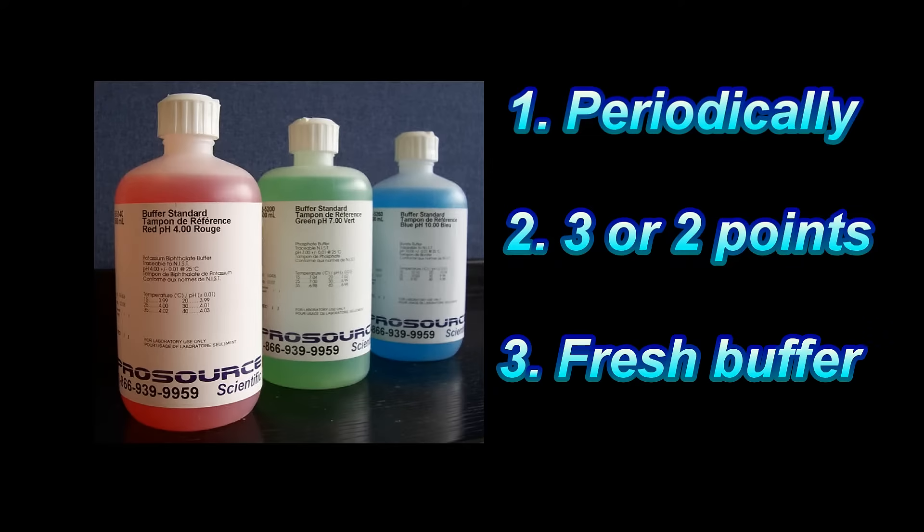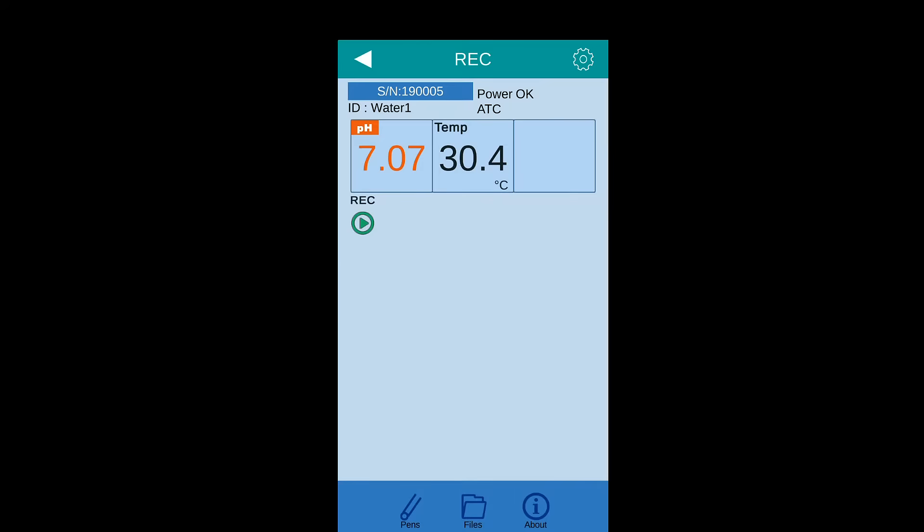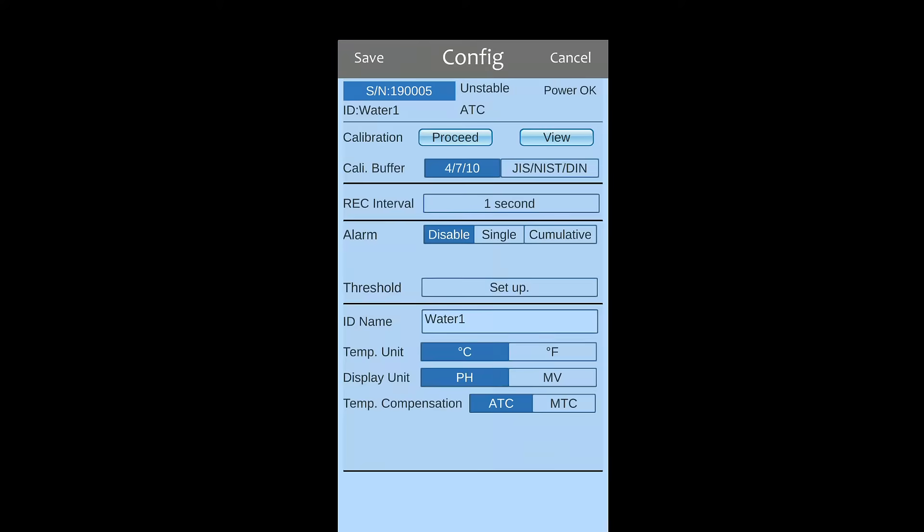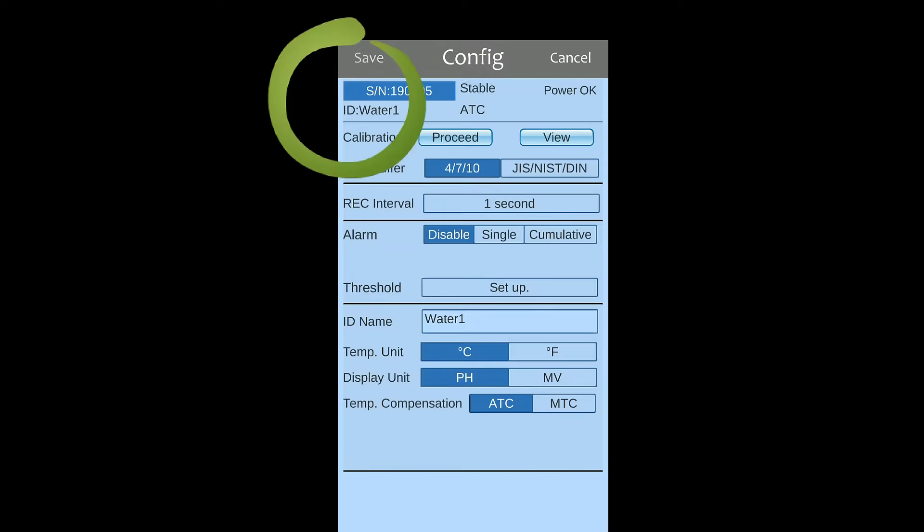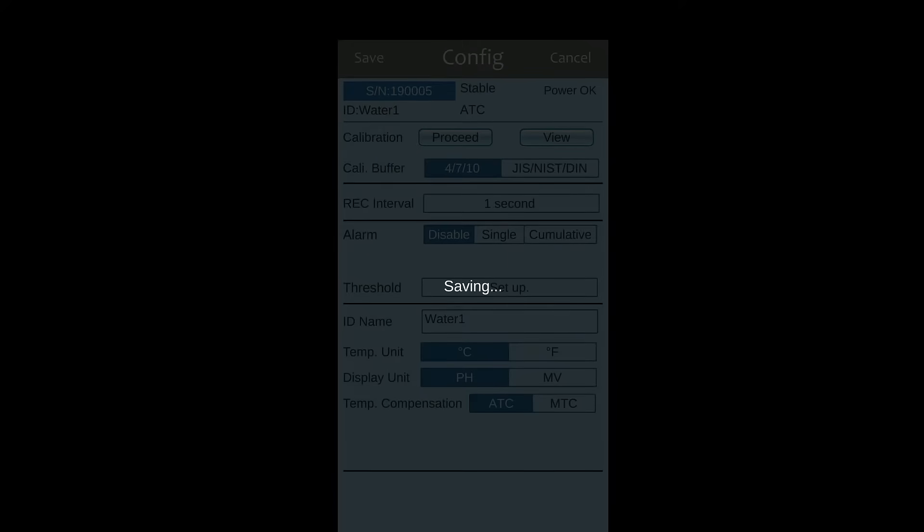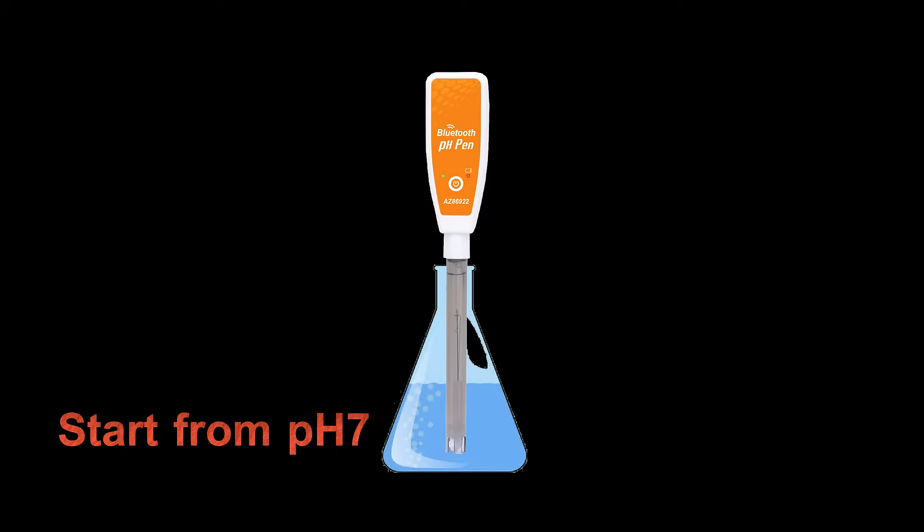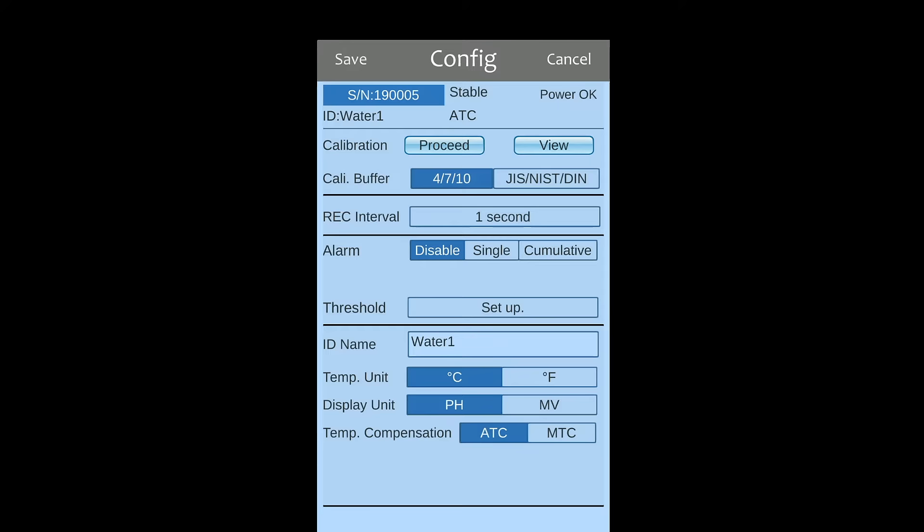Always use fresh calibration buffer and never reuse it. Press setting key from app and then choose the PH buffer system you are using. Be sure to save the setting before preceding calibration. Dip the electrode into PH 7 and stir gentle.